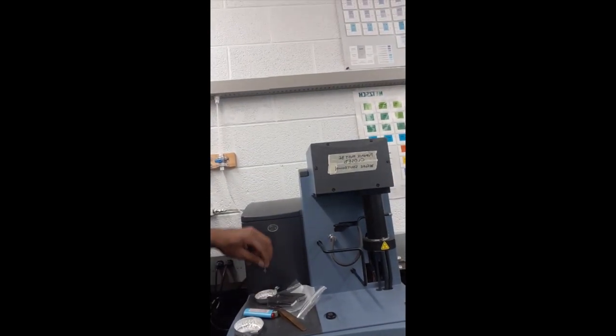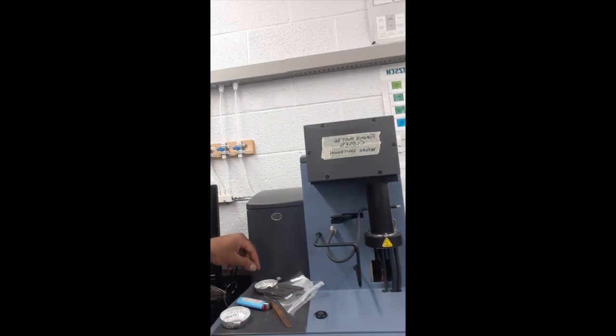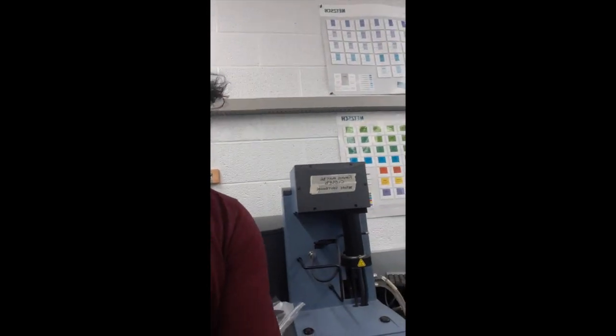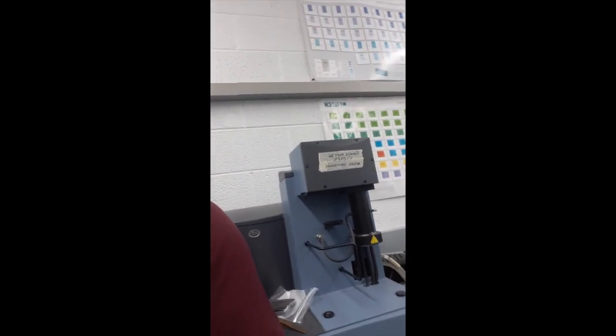So what we do is you load your sample into this tiny little pan, and you stick it in here, in this furnace, and after heating up, you can track what the changes in mass and other properties are. We use this a lot, especially for polymer-derived ceramics, just because a lot of our material behavior and material properties are dependent on how much mass is lost and the species of elements and other phases present in our system at the end.